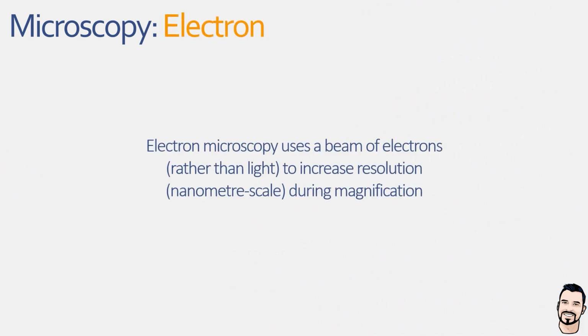And we now move on to our final microscopes, which are the electron microscopes. Now, unlike the light microscopes, electron microscopy uses beams of electrons which also move in waves but have a much shorter wavelength, at around 100,000 times shorter than visible light. This dramatically increases both magnification and resolution, allowing us to visualize structures at the nanoscale rather than the microscale.